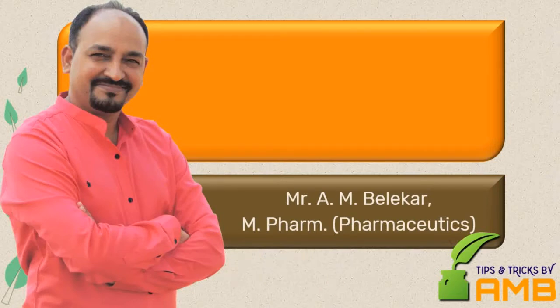In the previous video, we discussed that the process of extraction which involves passage or flowing of menstruum through a drug for a short period of time is called percolation. We also discussed that the percolation process is of three types: simple percolation, percolation for concentrated preparations and continuous hot extraction process.